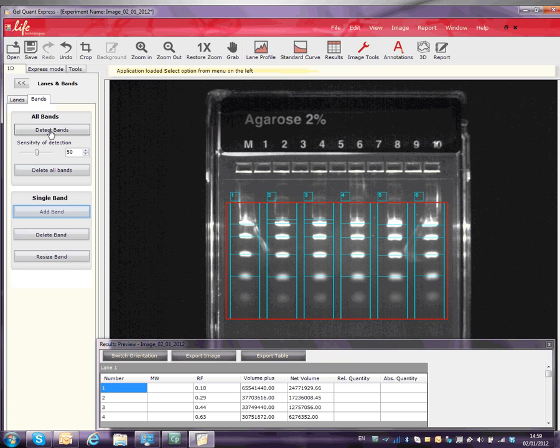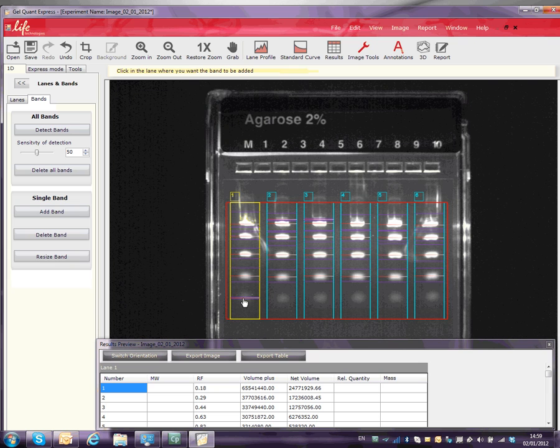Add these bands by first clicking the Add Band button, then clicking on the band in the picture. You can add multiple bands this way.